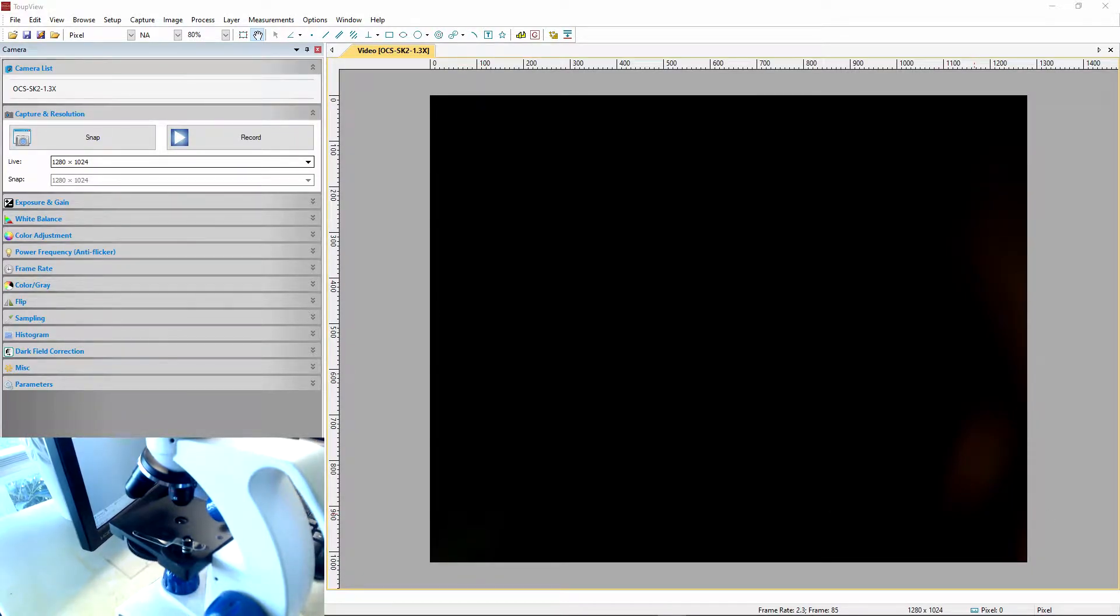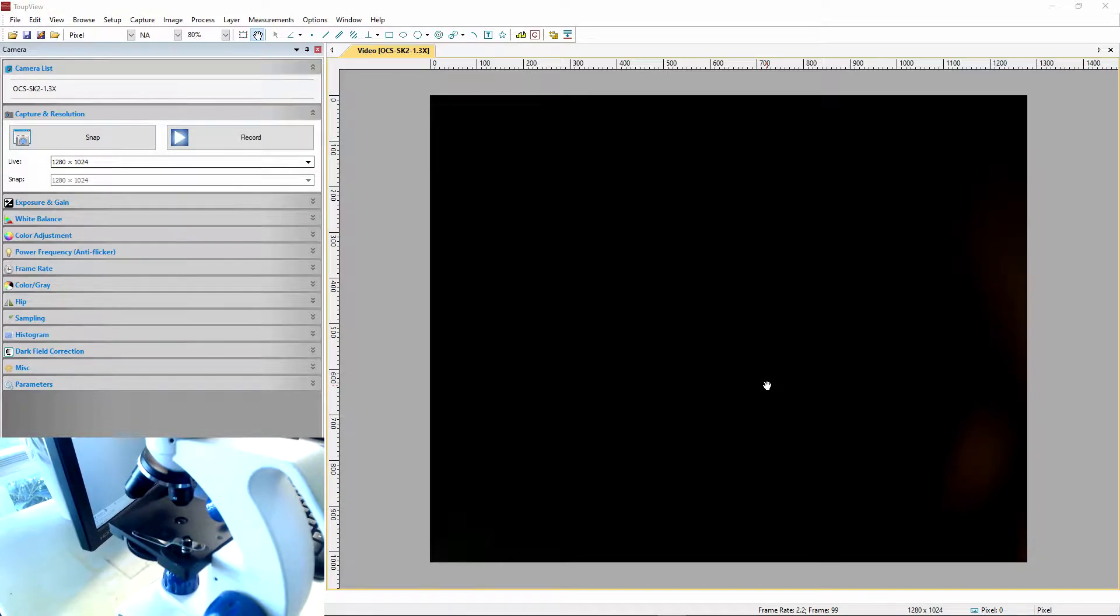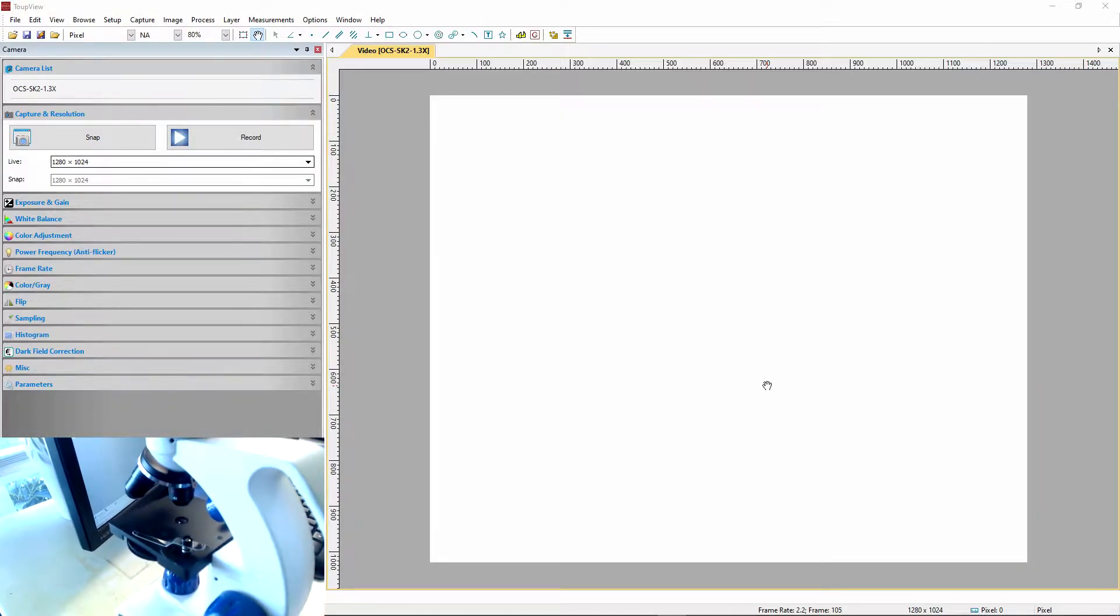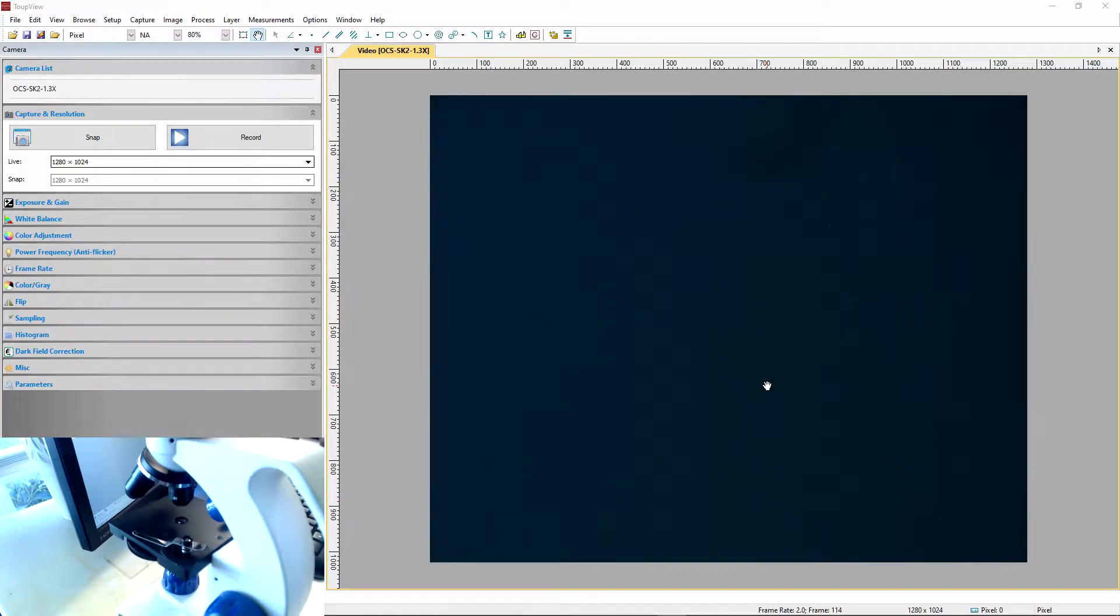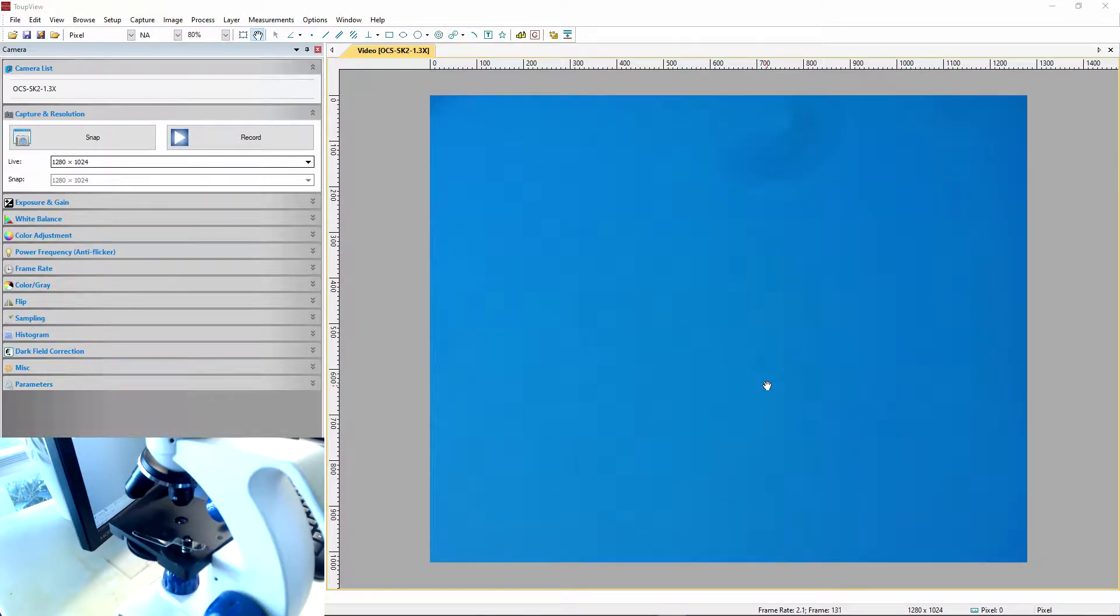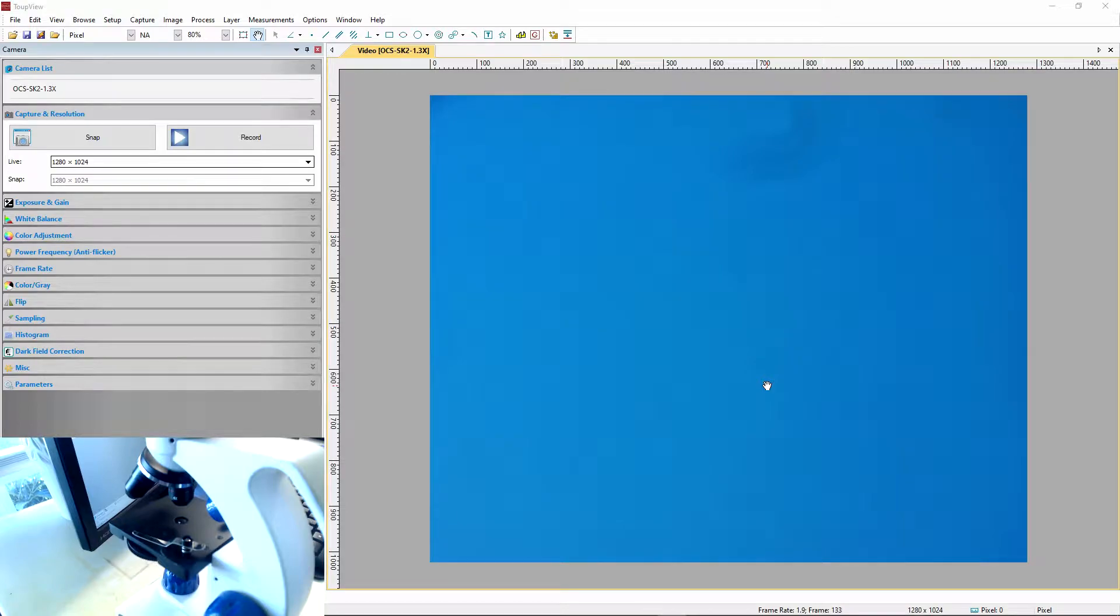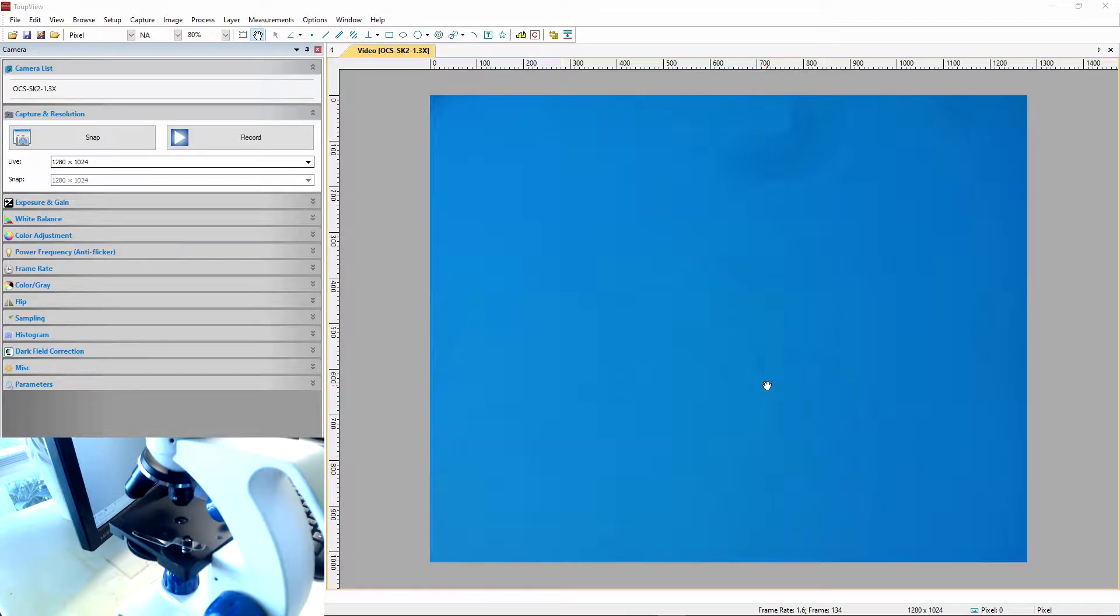We got a microscope camera, so we're going to see how this works out. And on the big right here, you can see the slides once I turn it on. I have a big box of I think like a hundred slides, but I'm afraid when I open it, it's just going to explode. So, we're not going to do that. I haven't really experimented with this because I wanted it to have a fresh, a blank slate of my bad ideas put on the table.